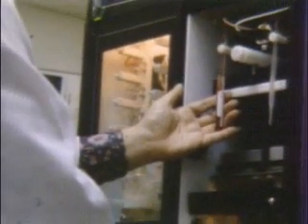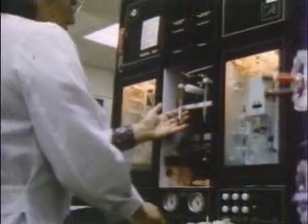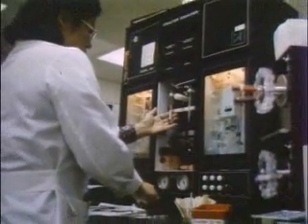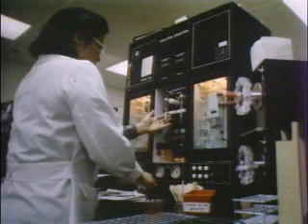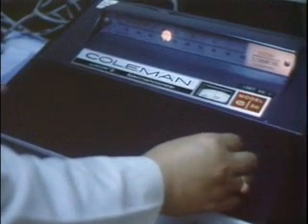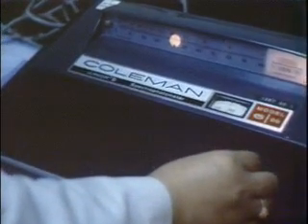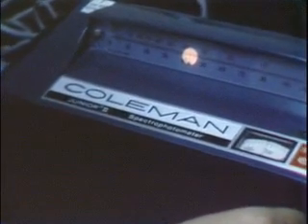A medical technician can take a prepared sample of blood and determine the concentration of hemoglobin present in the blood. This determination is done by a technique called spectrophotometric analysis. Spectrophotometric analysis uses the principles of Beer's law. Beer's law was formulated about 200 years ago. However, the foundation upon which Beer's law is based is rooted in man's basic understanding of the nature of light.